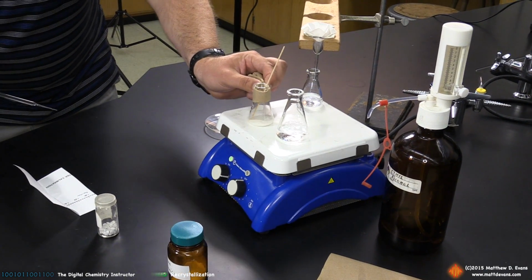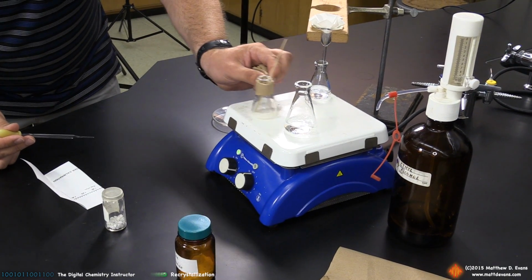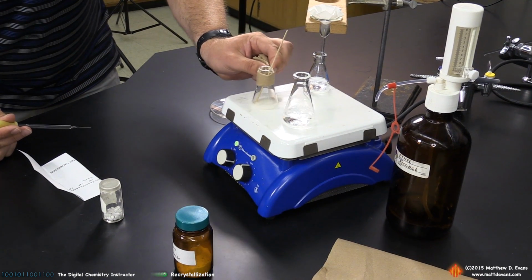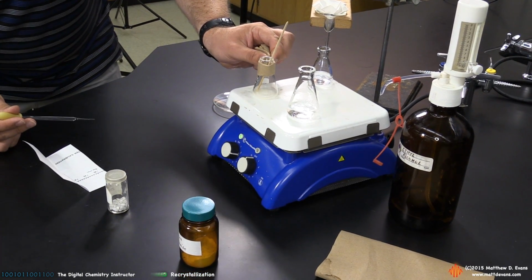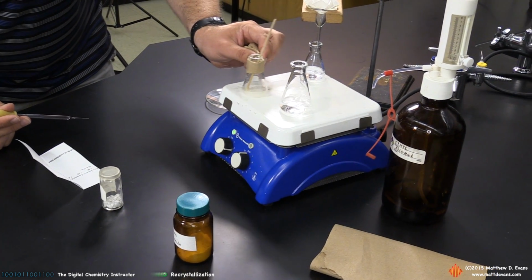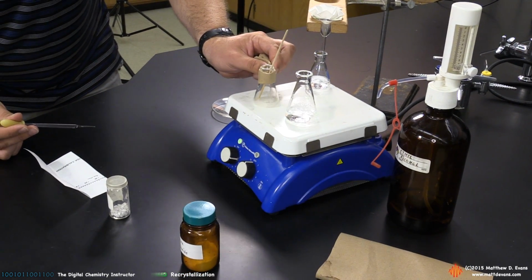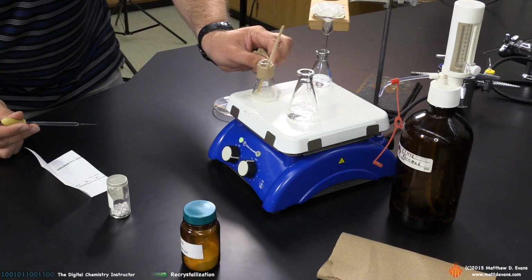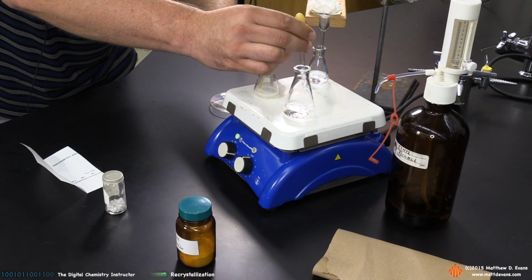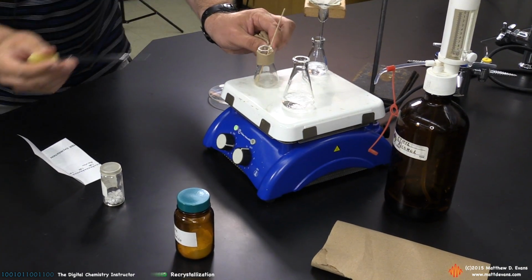Onto the hot plate. Try not to take it off the hot plate too often. I may have to take it off just to check to see that the solid is dissolved. So every 10 seconds I'm going to want to add. Well, I'm going to wait and see that it's boiling first before I add. Okay, now it's boiling, so I'm going to put another shot in. Again, don't spill on the hot plate. You're going to end up with a fire.